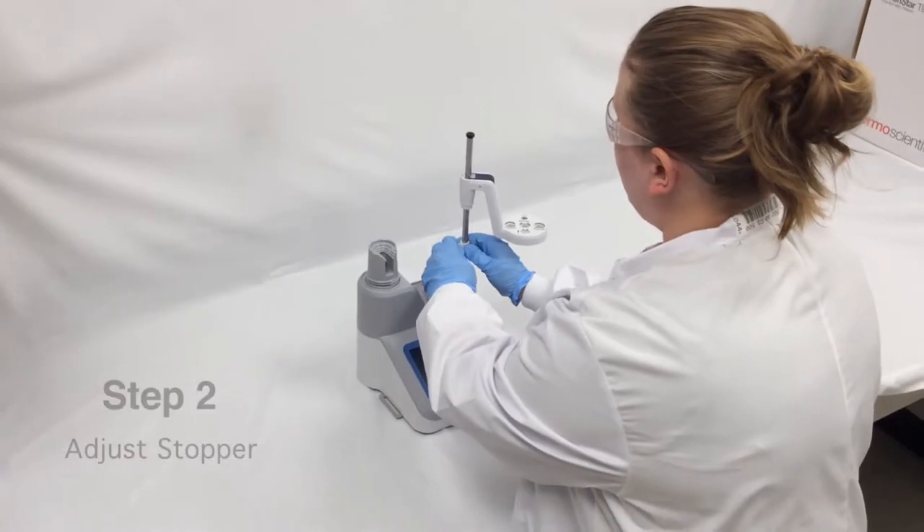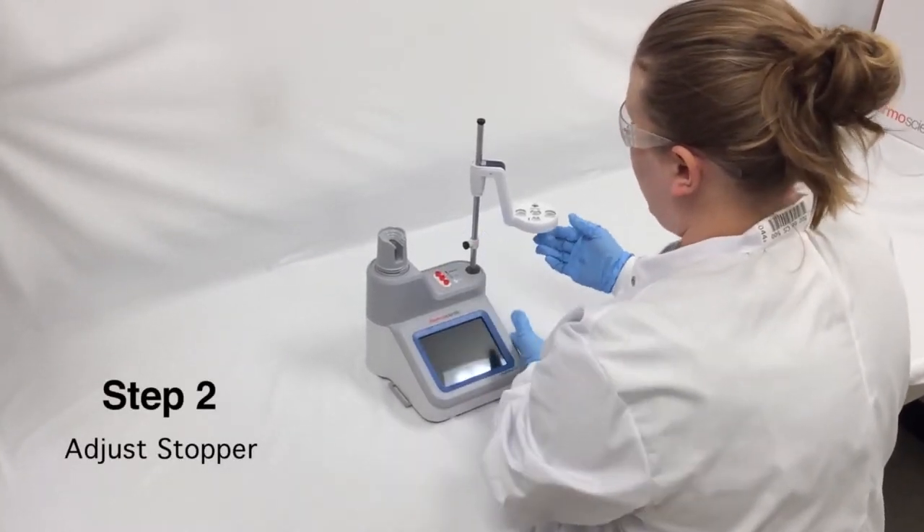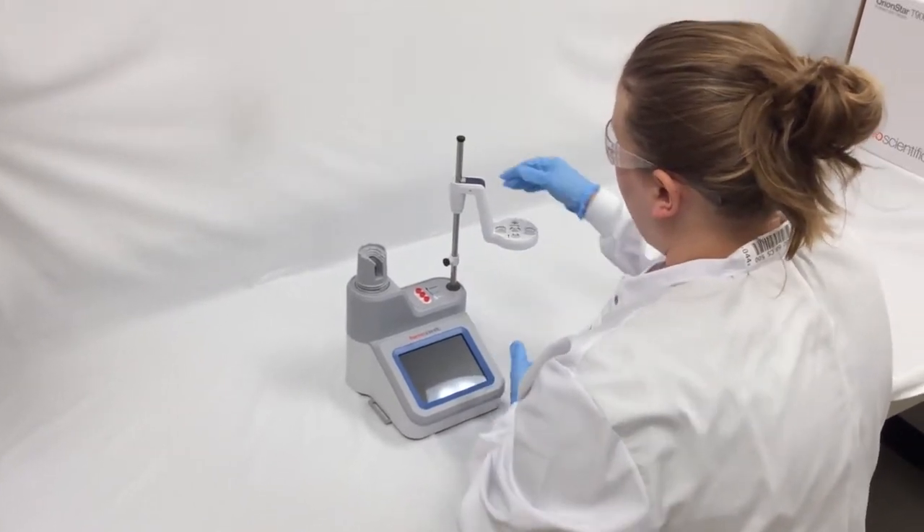The next thing I'm going to do is adjust my stopper. This prevents my electrode head from going down too far and possibly damaging the electrode.